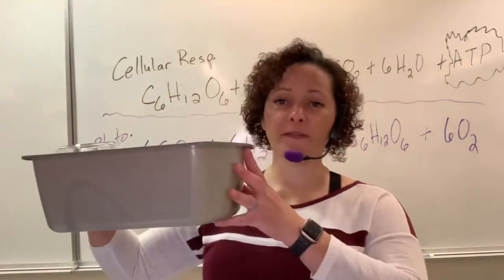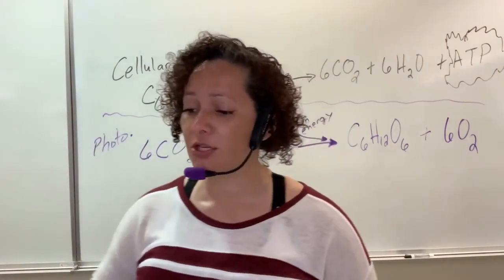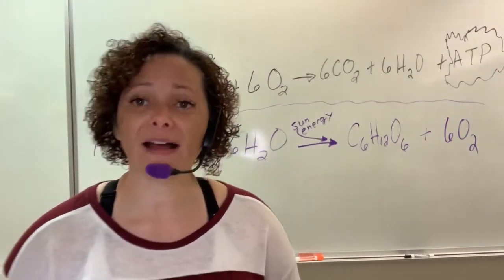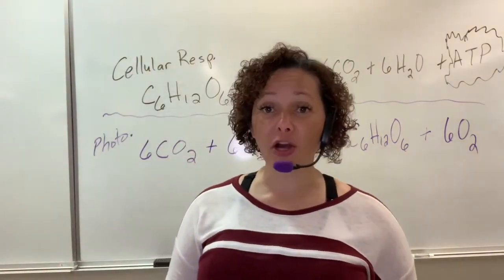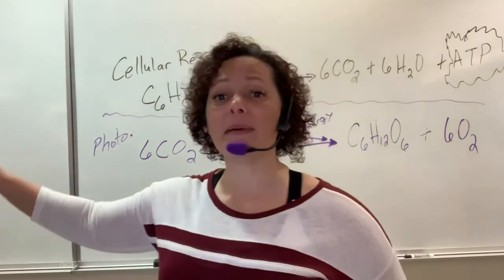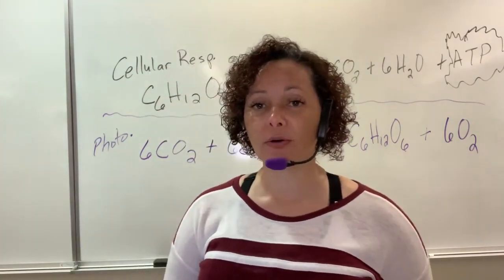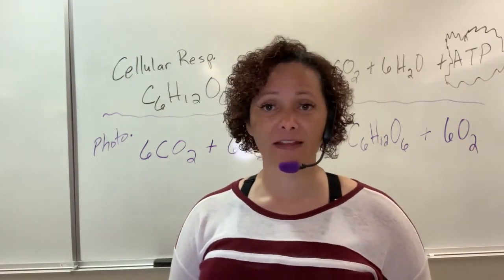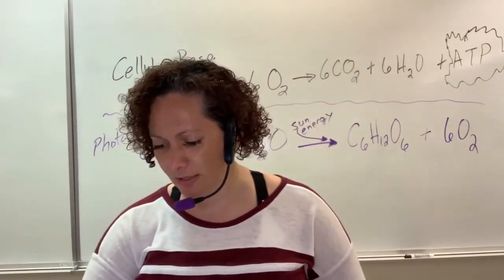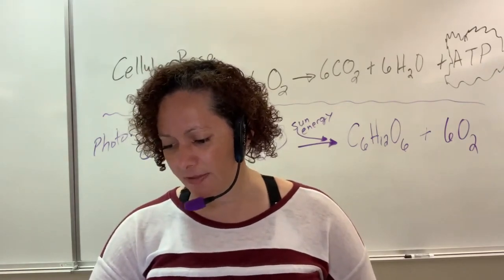Your materials will be found in one of these buckets, or if you're at the other campus, in the green bucket. Make sure all your materials get back into the buckets, but make sure your organisms are classroom materials and they get back to the classroom cart, okay? We don't want poor little organisms left in the bucket where they're not going to get fed and then they end up dying.